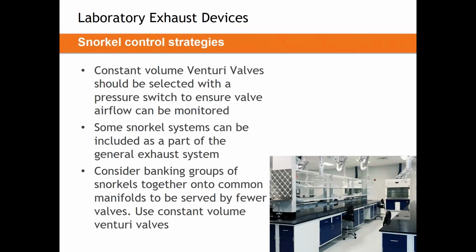So again, snorkels can introduce a lot of variability to a lab, pardon me. They can introduce a lot of complexity if we'd like as well. Our recommendation is to keep snorkels simple. They are a simple device. They exhaust heat and non-toxic particles. So using them as a simple device is the best way to go.